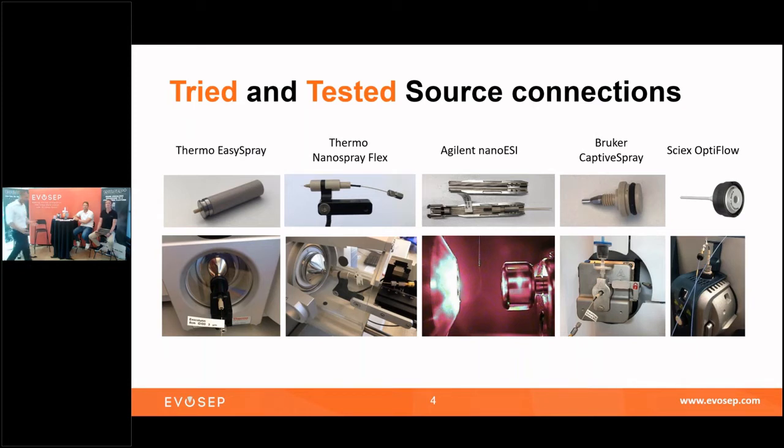Yeah, so I guess we can also ask Ole if he wants to say something about the... Yeah, that's great. So we also have Ole who's leading IMD. And I think it's fair to say that it's been really important for us to make these connections and also make sure that they're easy to use and you don't need tools. It's basically finger-tight connections, right?